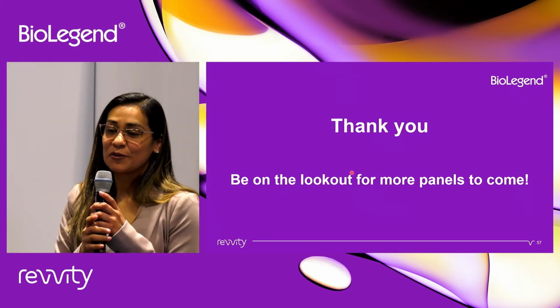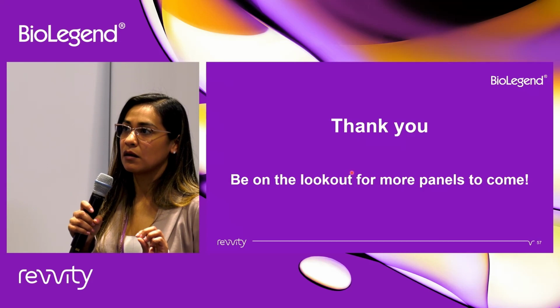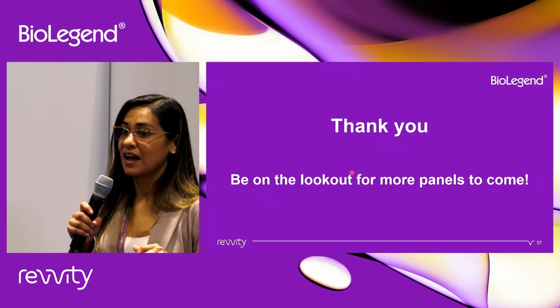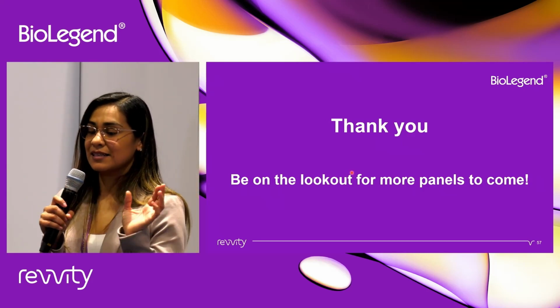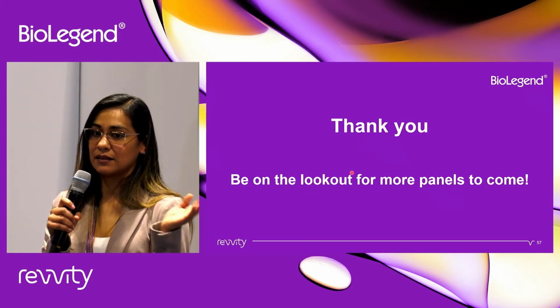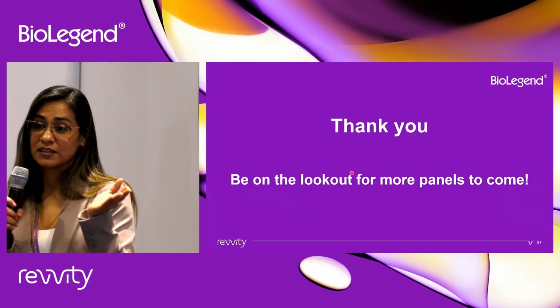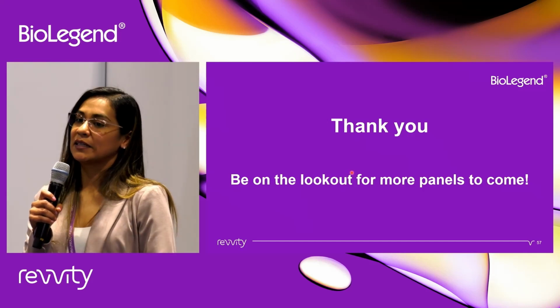I'm not sure if we are already ready for that part. I think there have been some people trying to use AI to come up with the best combination of fluorophores and dyes, and it's not always working in reality as it is in theory, on paper. So at least at this point, we are not ready, or far from that option. You cannot translate what AI is saying to the actual experiment, at least at this moment. Maybe in the future, we are going to have a better technology that gives us the best combination among all of them, but not at this point, I believe.